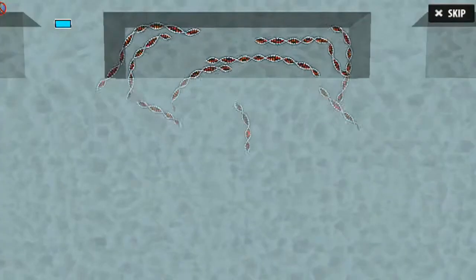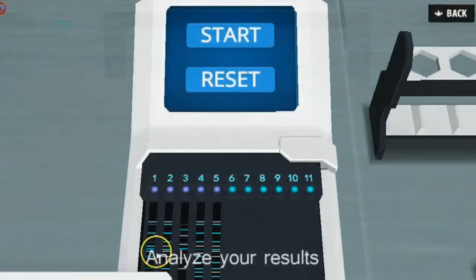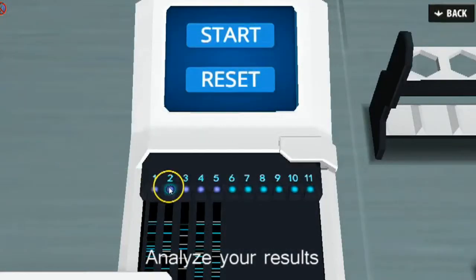Right. Now that we have enough amplified STR for analysis, we can run the gel electrophoresis. Observe the pattern. Can you find out who the murderer is?